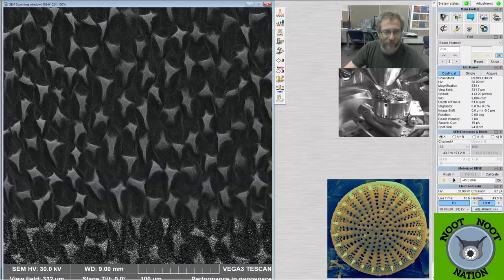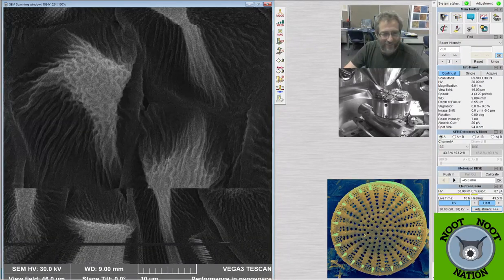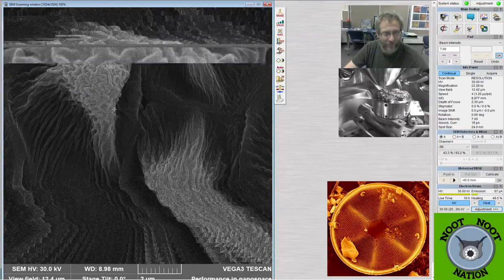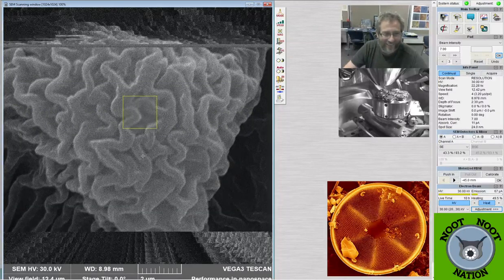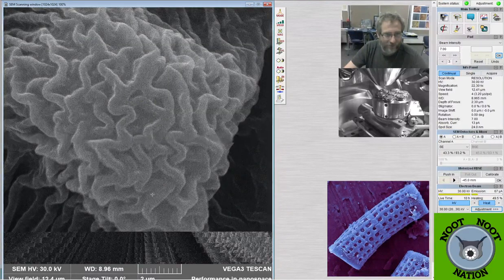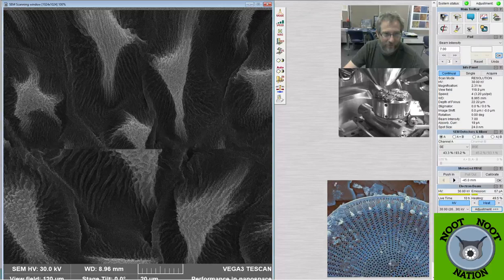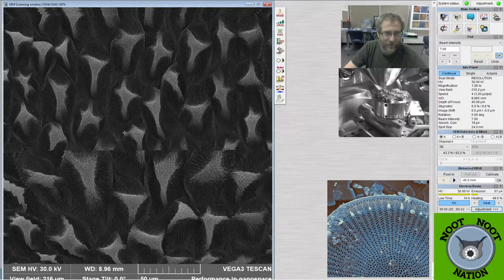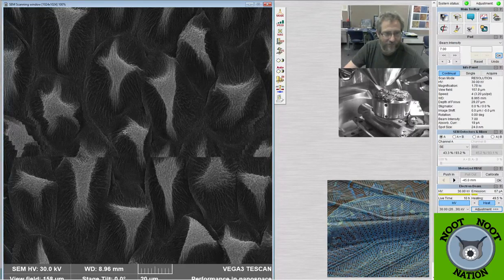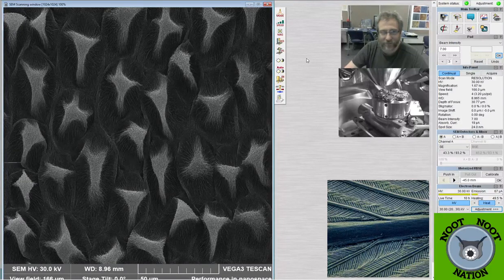Get ready, because I'm gonna zoom in here and you're gonna be like, what? This is the crazy detail of the SEM. No matter what I do, we can keep zooming in and you're going to probably be like, what's happening right now? We're looking at the surface of a violet, the petal of a violet right now. So that's what these little dots are, cells. I can see the plant cells if I zoom out. There you go. So we're just actually looking at the petal itself right now, and these things look crazy in the SEM, don't they? Just the detail and the textures, I just love them.